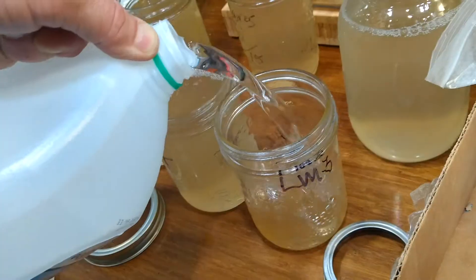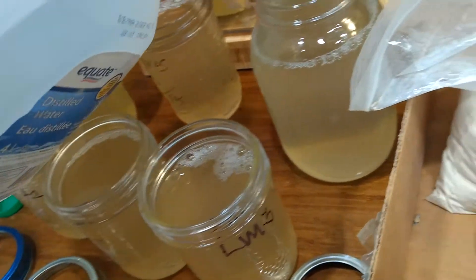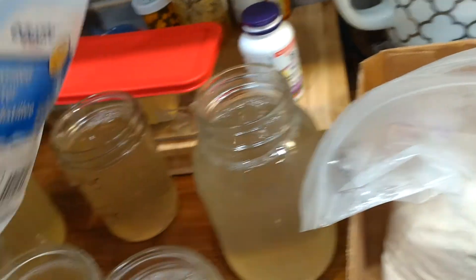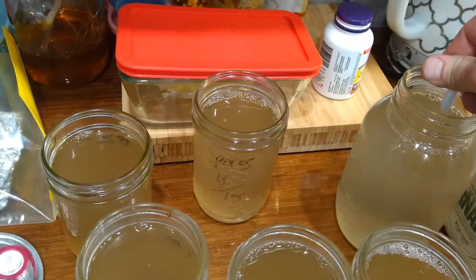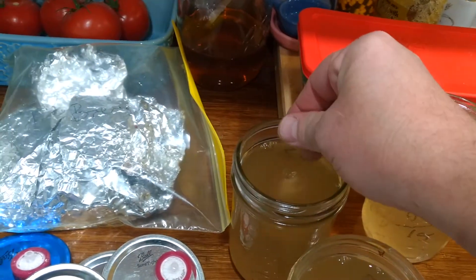It doesn't have to be cold — lukewarm, whatever. Fill it all up and then we're going to be adding some stirring weights to each jar. You don't want to forget the stirring weight because you don't want to have to put them in there after the fact — this could cause a mold problem or contamination.